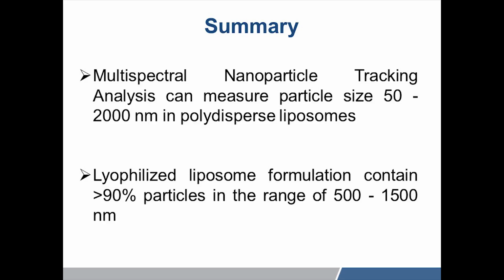Also, if your particles have a very high refractive index, then NTA can give you much better results. But for polydisperse liposomes, we saw that this works well up to 2 micron, and we cover most of the particle sizes, and that's where we are confident that this is an application of choice for the vaccine formulation that we will generate based on these liposomes.